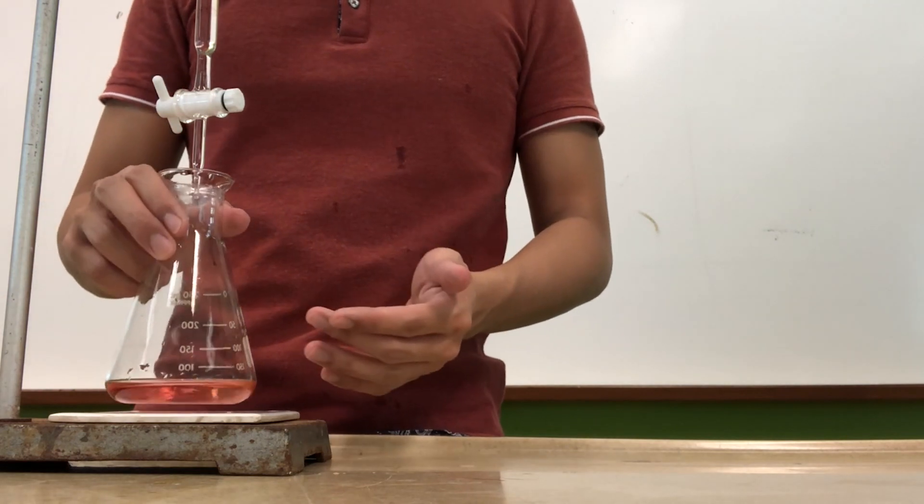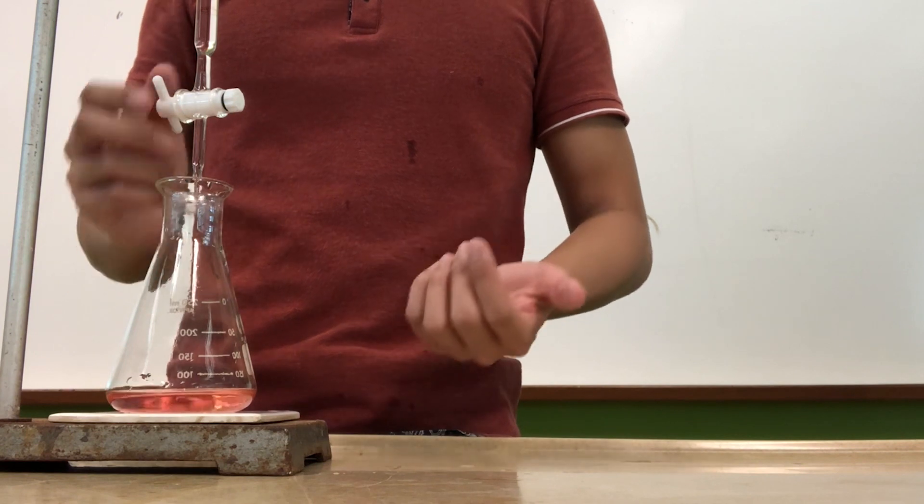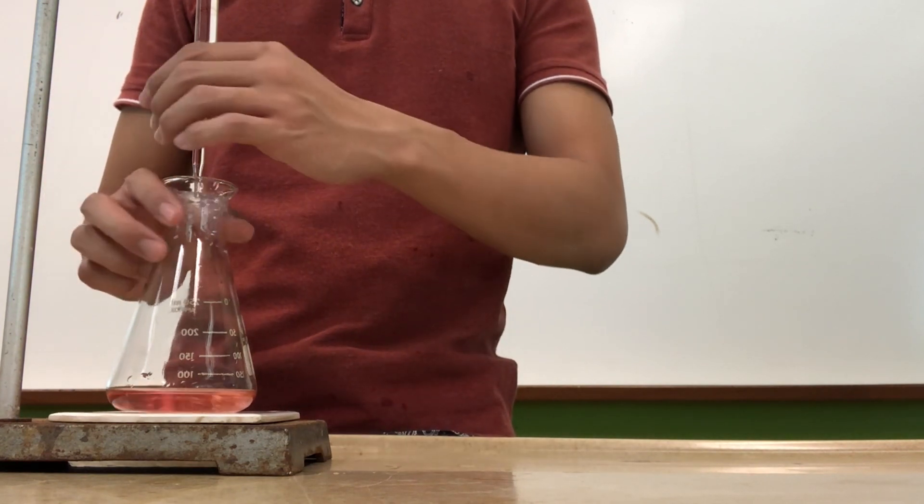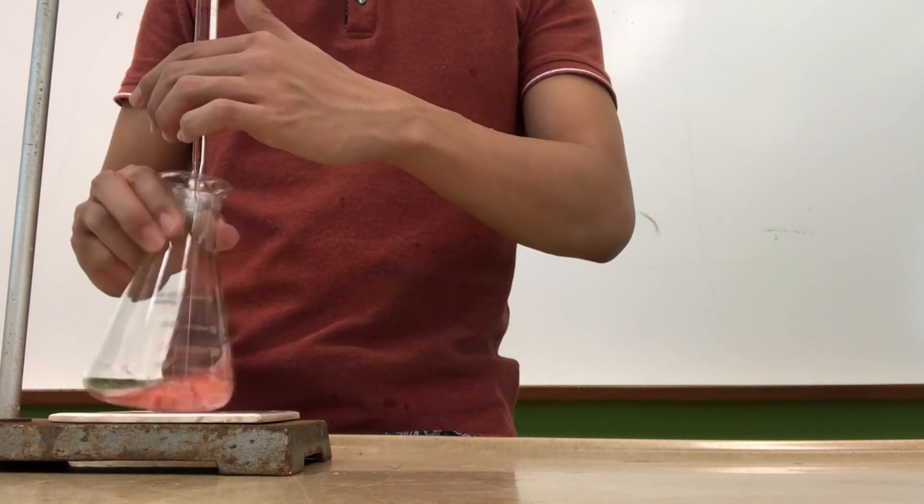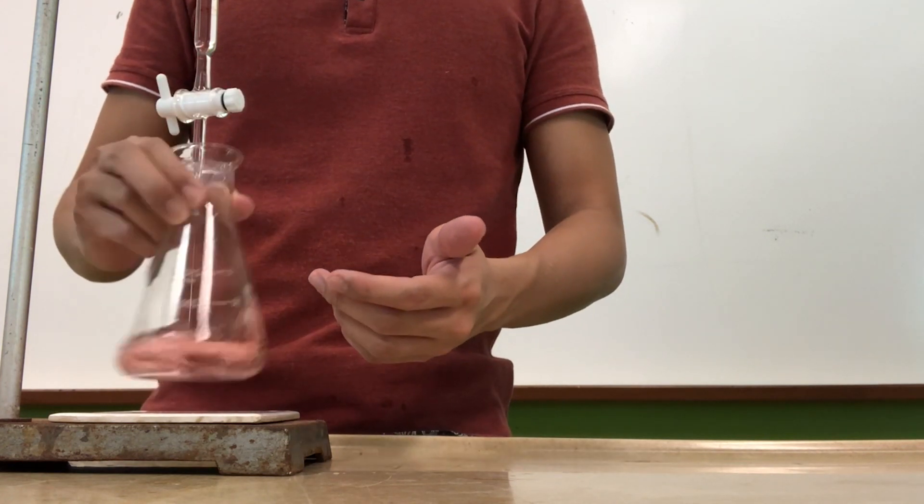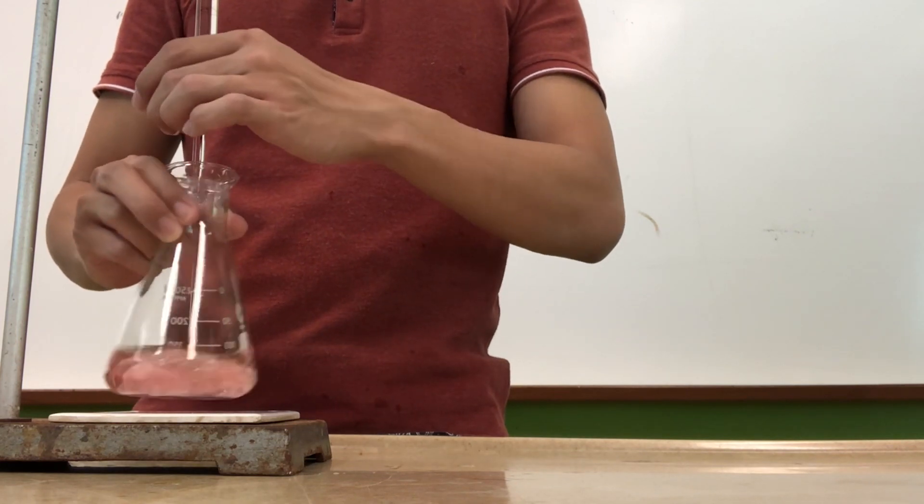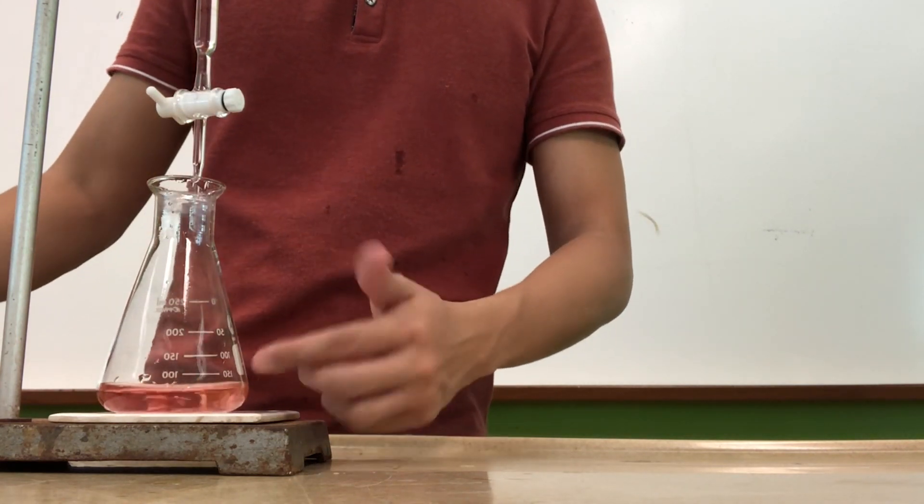Now just a reminder that during titration, consistency is very important. It's important to make sure that the final results that you choose are within ±0.20 cm³ of one another. That is how you can achieve the consistency within your values. So we are going to continue to add in the titrant until we start to see a form of color change that tends to stay for a while and disappear once we start to swirl.